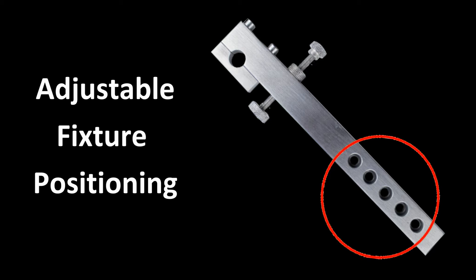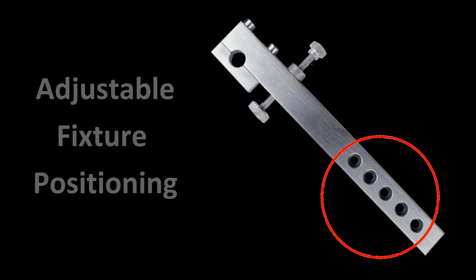This will be demonstrated later. In general, the specimen should be positioned to the back of the blade apex in order to minimize drag.